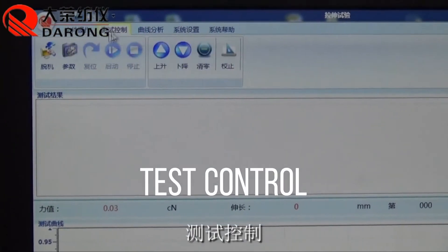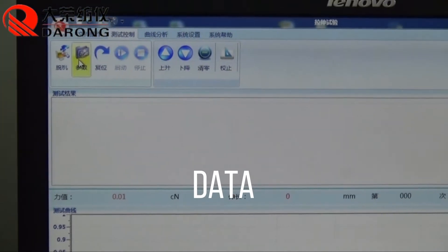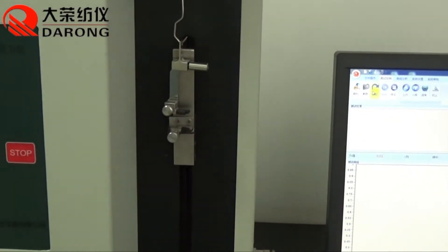Go to Test Control and check the data. Reset the terminal machine.